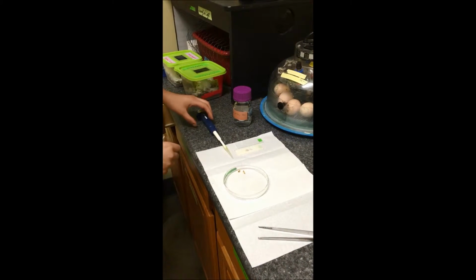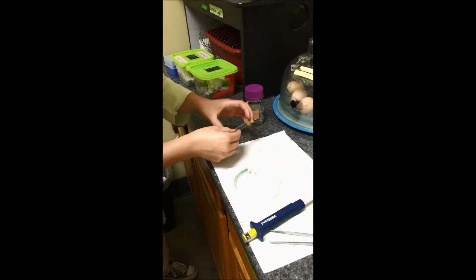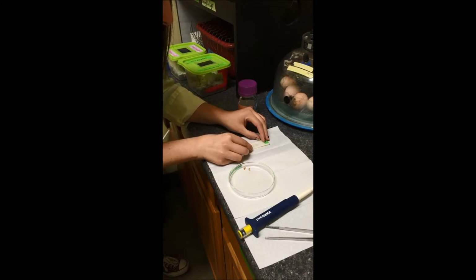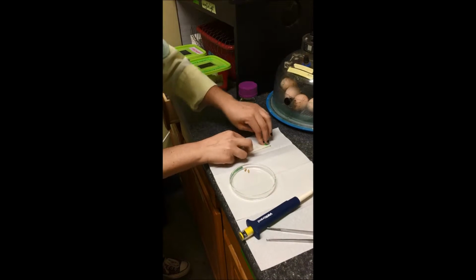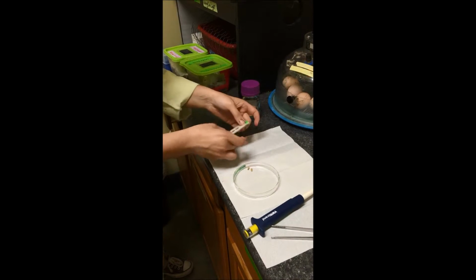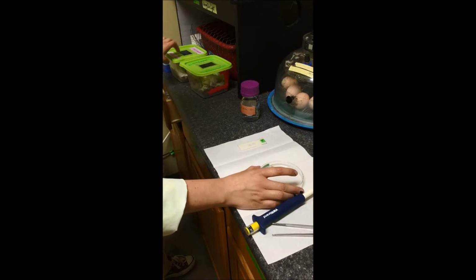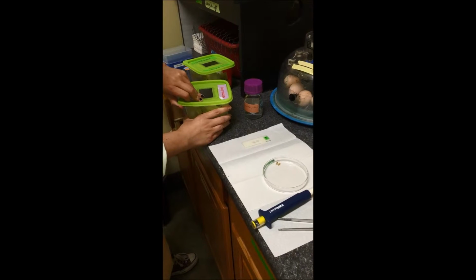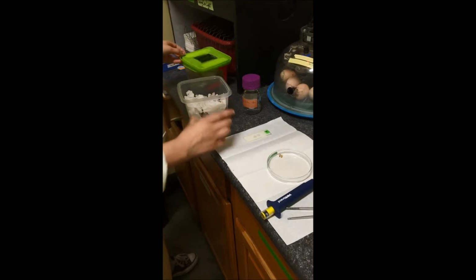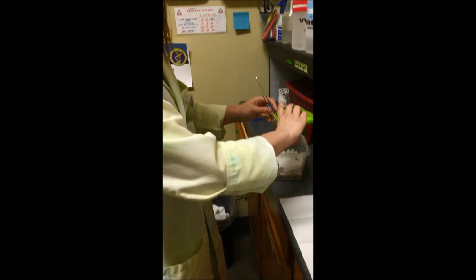So, what I usually do next, and what we have to do relatively quickly, is put the other side of the slide on top, because they don't like living in an environment with air. They'll die if they're exposed to oxygen in the outside environment for too long. And so that should keep them nice and oxygen free, hopefully. And then we put the termites in the resting bin so they can rest.